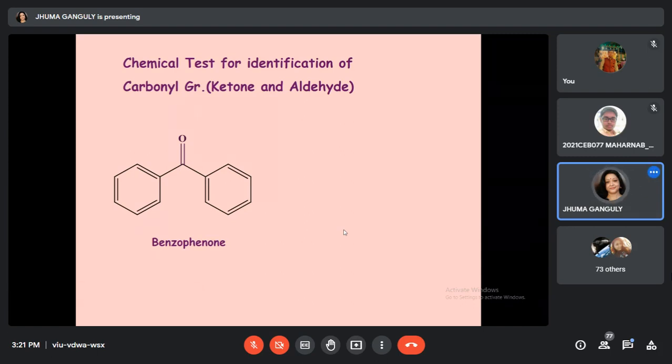These are known samples. You will go through this first, then next you have lots of classes on this. Actually, one month for this organic functional group identification. In this case, there are lots of keto groups, aldehyde groups, etc. You can just try by yourself. There are lots of samples. You try one by one to see. Sometimes one comes, one does not. That is practicing, actually. After that, you have one full day for practicing also.